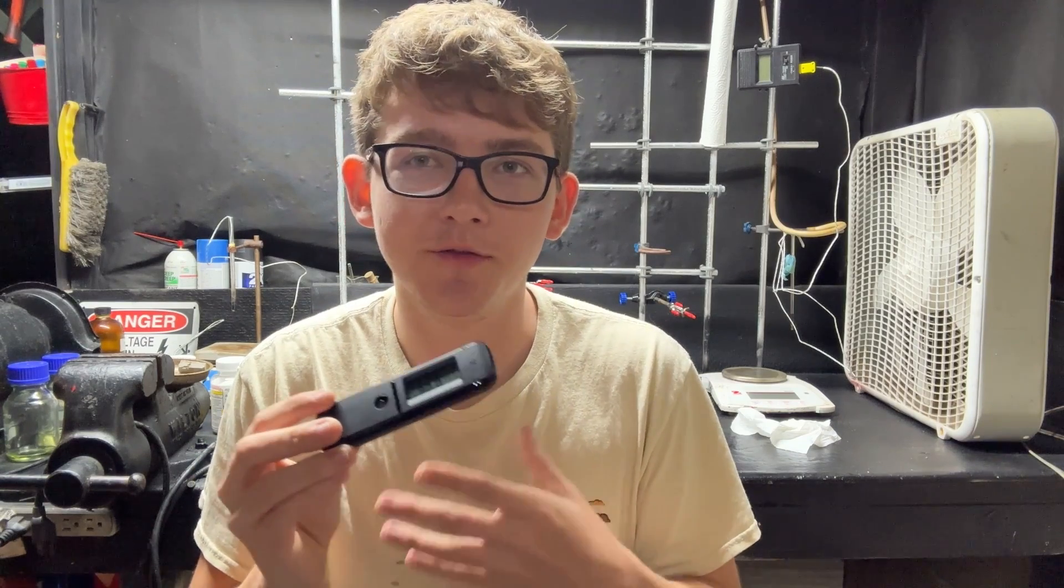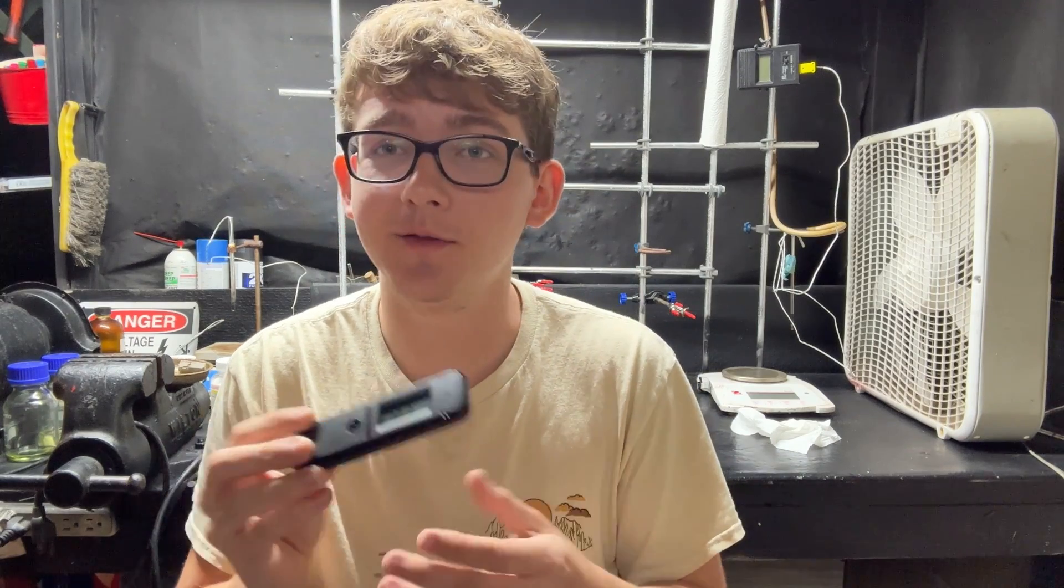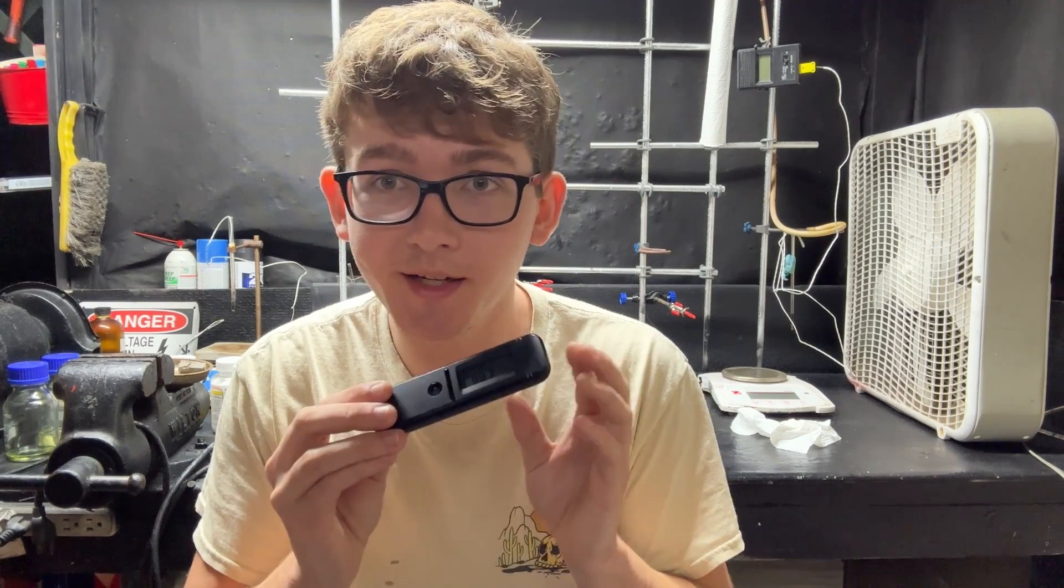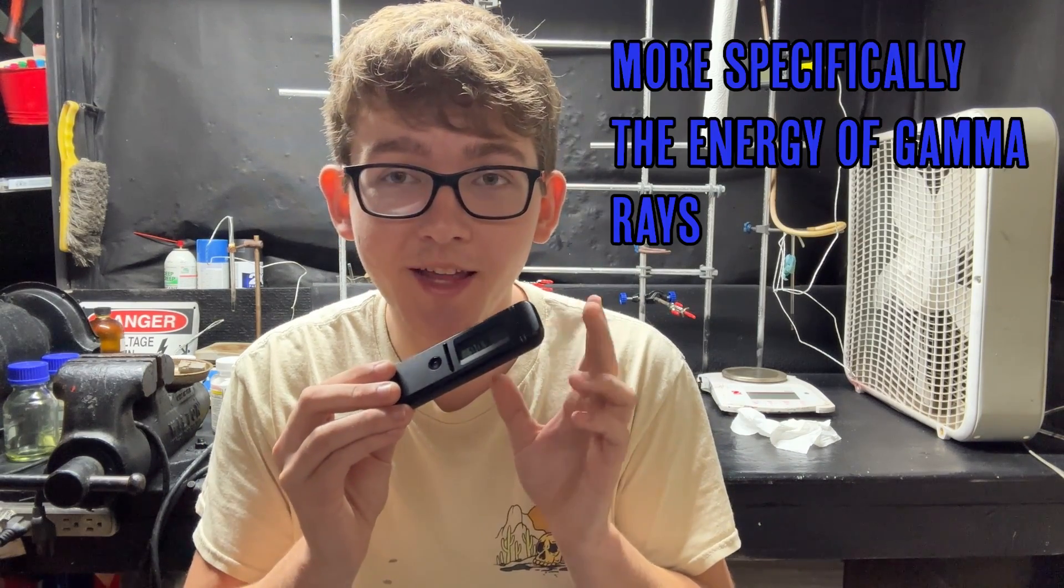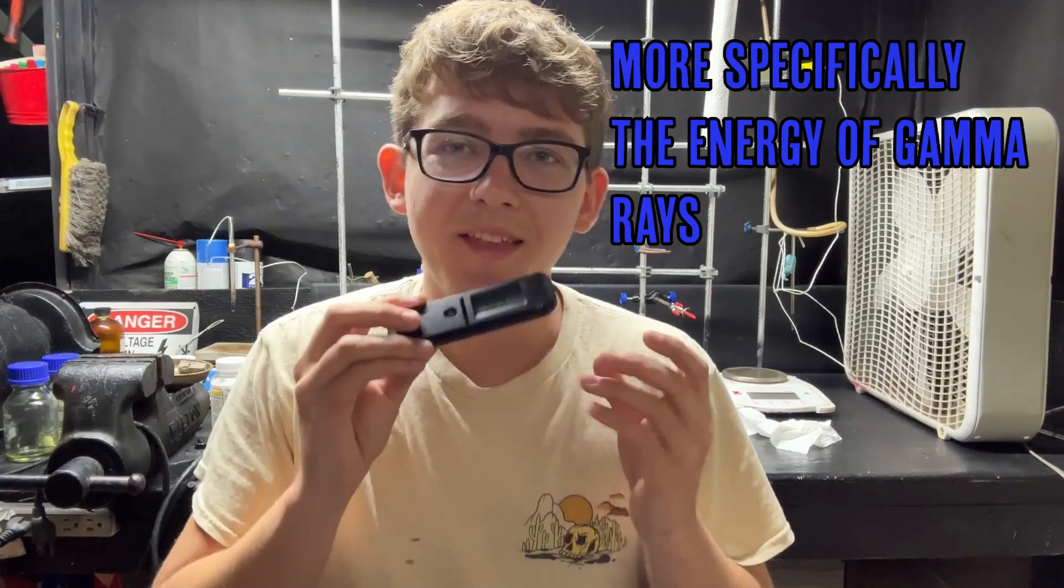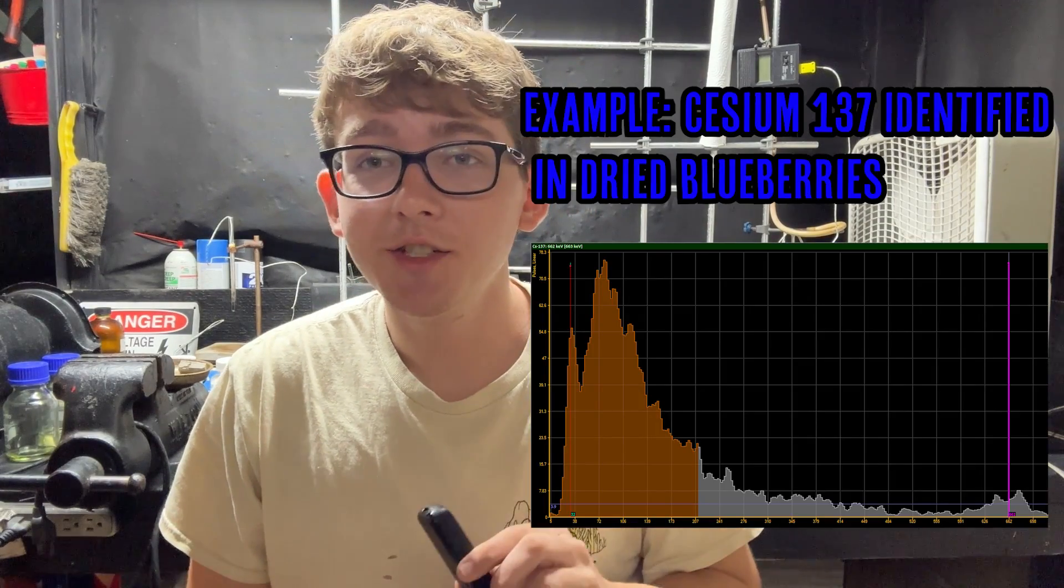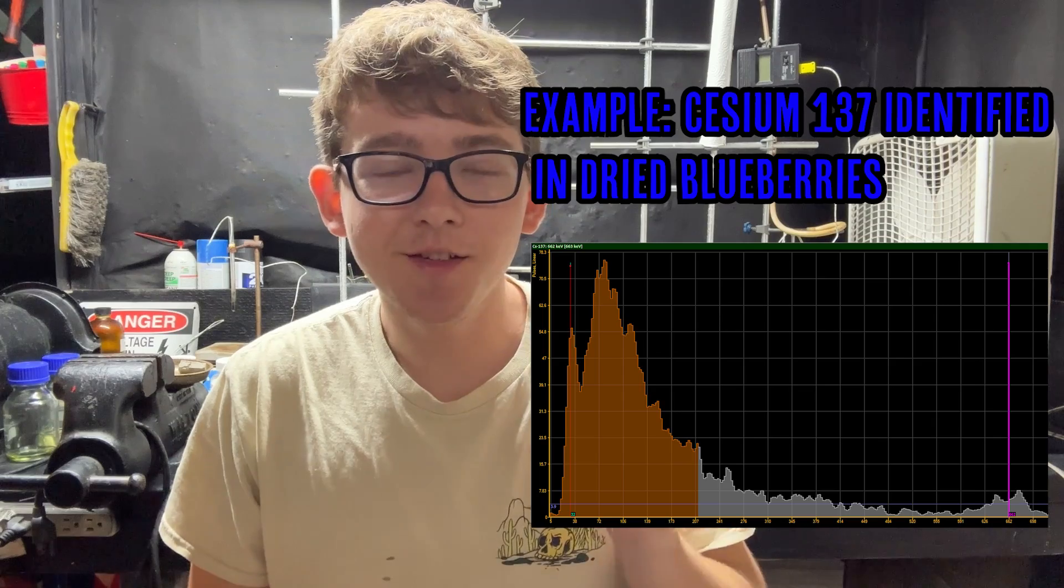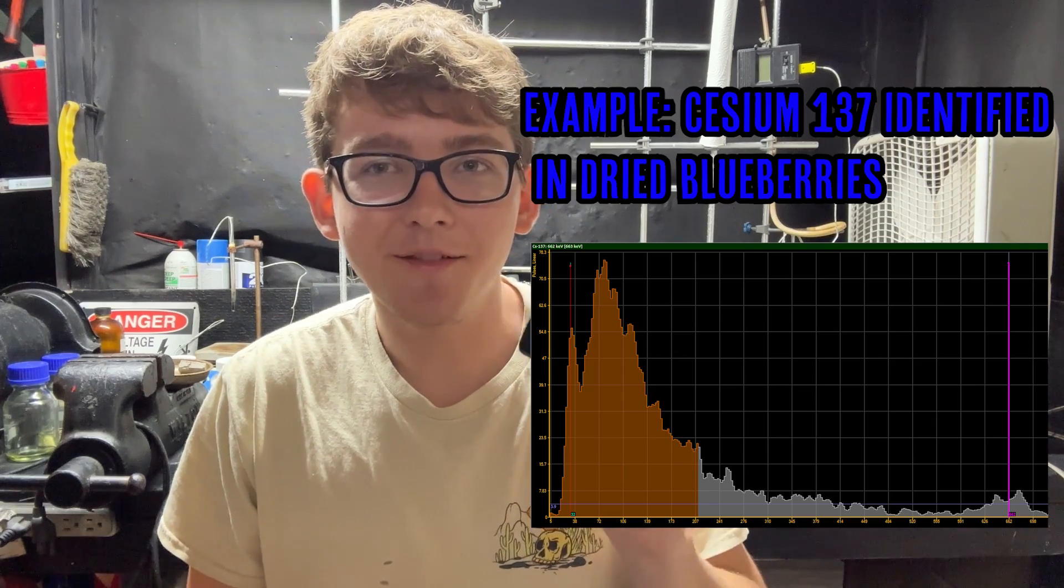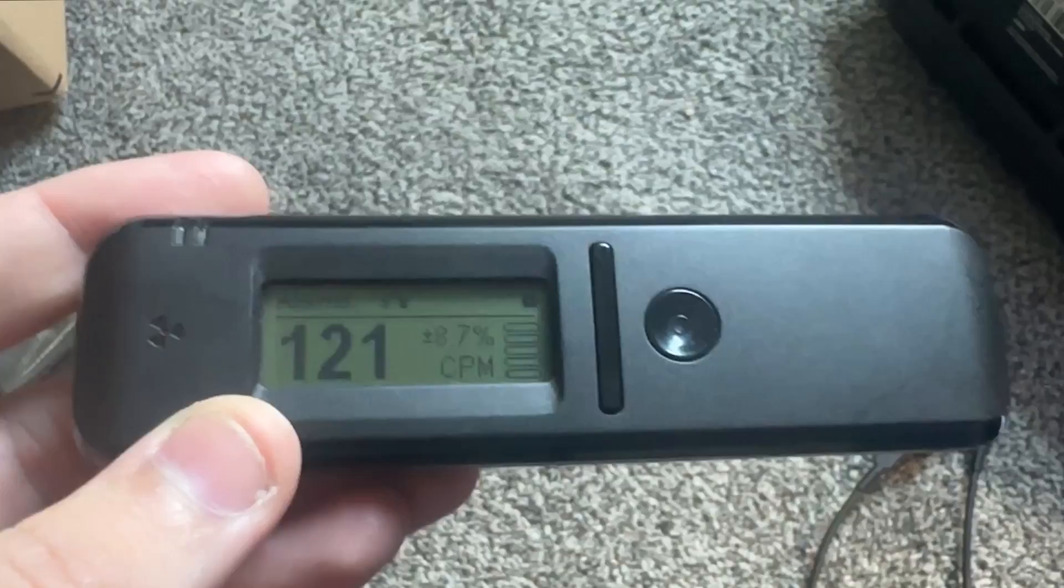Well compared to a normal Geiger counter, a normal Geiger counter is very black and white. It only detects if there is an incident of radiation or if there's not. But this right here can measure the energy of that radiation and that can tell you a lot of information such as what is emitting the radiation and we can even use it to identify elements. So let's get into it and I'm going to show you guys some of the awesome features and what you can do with this device.